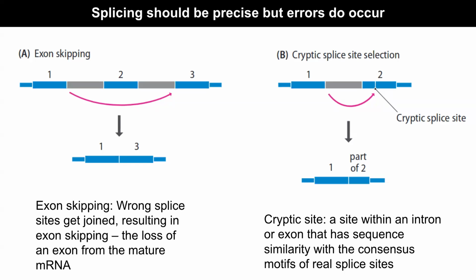So these are theoretical possibilities, not necessarily that you'll see all of them. But computationally, we don't know which of these isoforms are there in the data before you actually start to look at the data. So there is some hidden part here. What we do know, because we have been able to sequence the human genome and look at the RNA, is the likelihood or possibility of these isoforms. So we do have information available as to what the possible isoforms in humans are. Does that make sense?